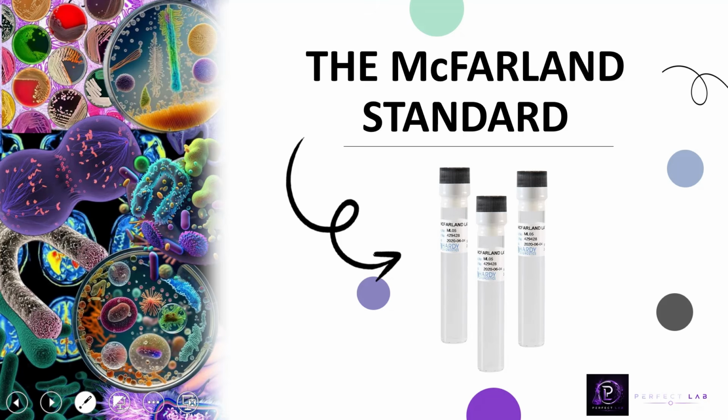So before bacteria can be tested against antibiotics in the laboratory, the bacterial suspension must contain the correct number of cells. And if there are too many or too few bacterial cells, the test result may be inaccurate. So this is where the McFarland standard comes in. The McFarland standard is a simple but essential tool used to standardize bacterial density before antimicrobial susceptibility testing. So in this video, we will explore what it is, why it's important, and how it's used in the laboratory.